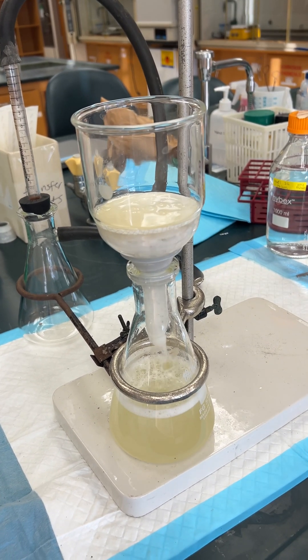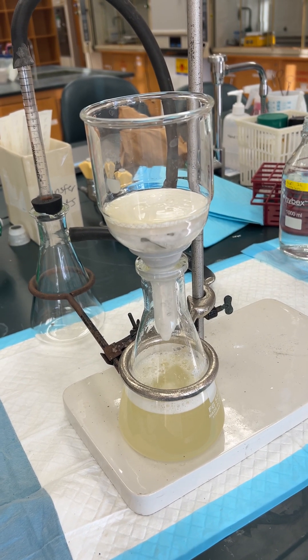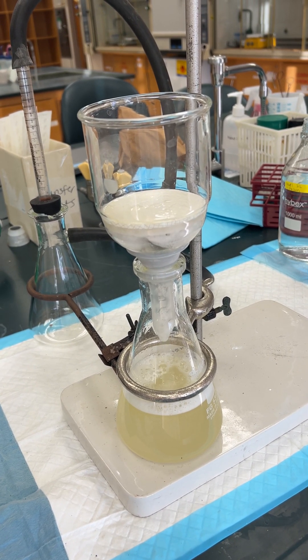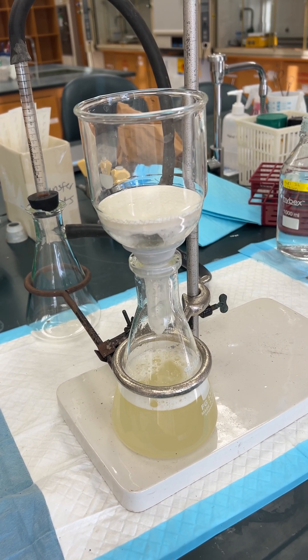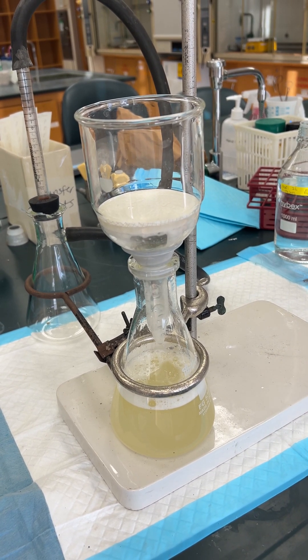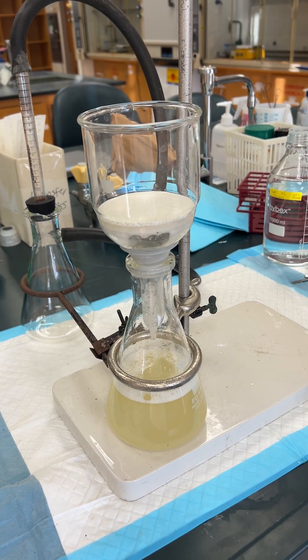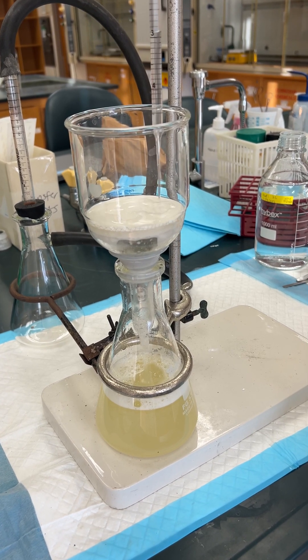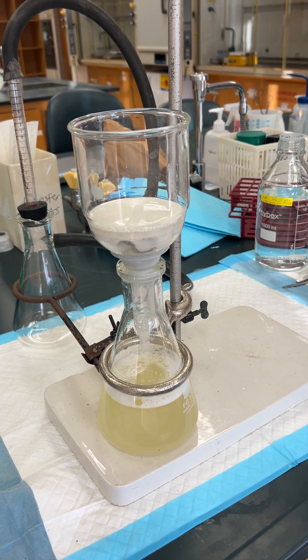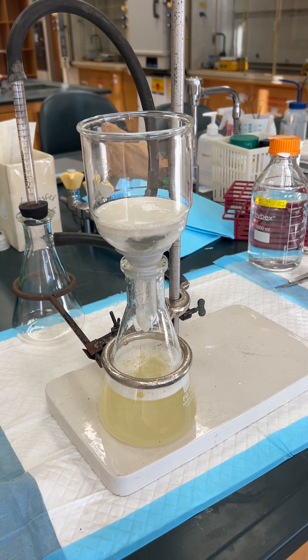And then as that's filtering through we're going to take five milliliters of NaCl, and then once that's done going through then we'll put the NaCl in. Then we'll check this and then that's when we're going to grab this alcohol.